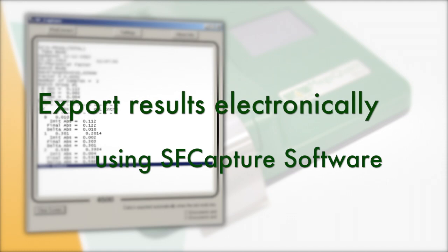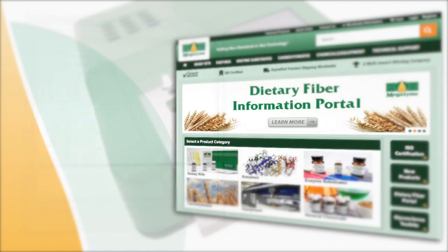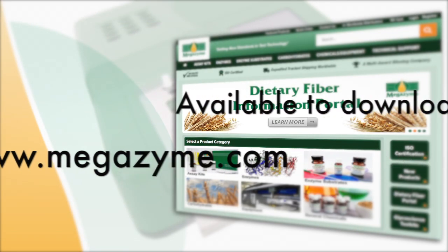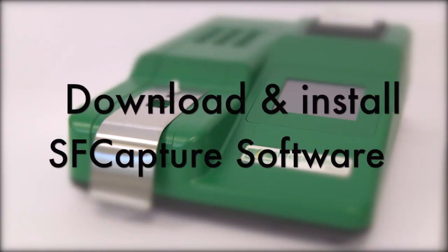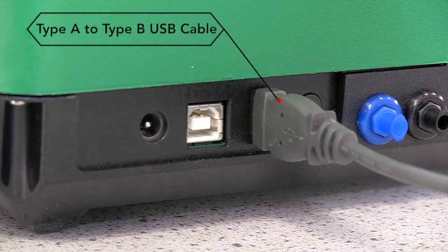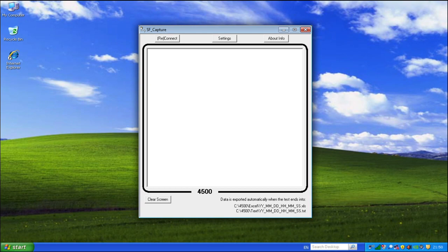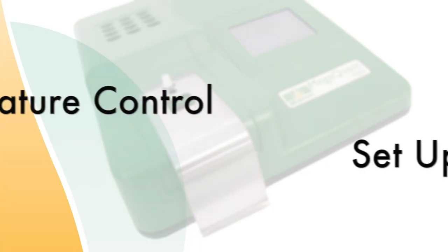An alternative to using the printer for output of results is to export the results electronically using the SFCapture software. The software is available to download along with instructions from the Megazyme website. To connect the MegaQuant Wave to the PC, download and install the SFCapture software onto a Windows-operated PC, then connect the MegaQuant Wave to the PC using a Type A to Type B USB cable. Now open the SFCapture software on the PC. The software should be automatically connected to the MegaQuant Wave.